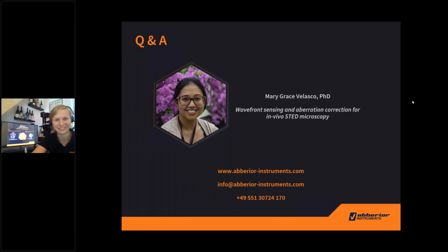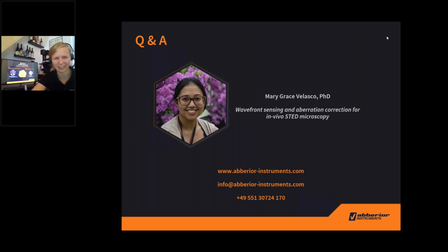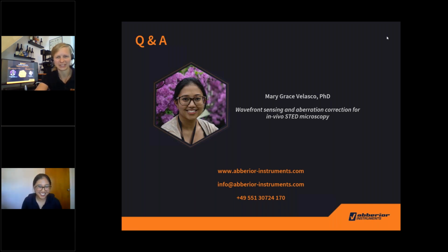Great, thanks, Mary Grace. That was an excellent talk, and you really showed amazing STED images. Actually, we got quite a few questions. So the first question is, can you comment on any phototoxicity or photo damage during the in vivo experiments?